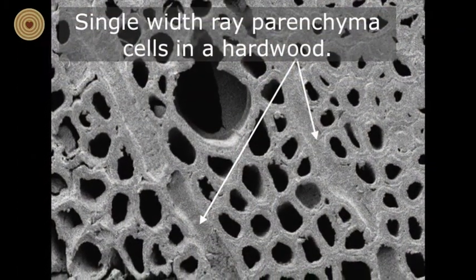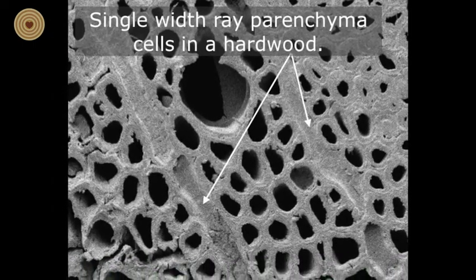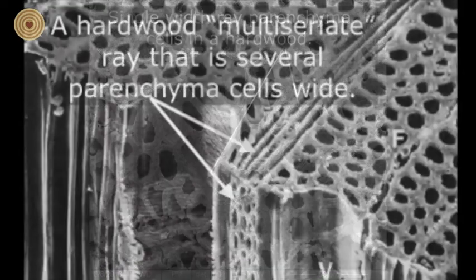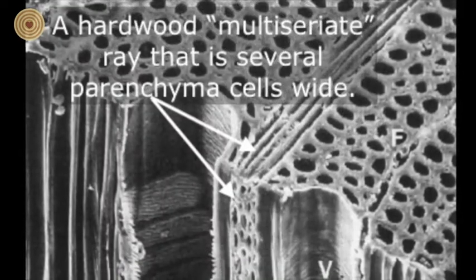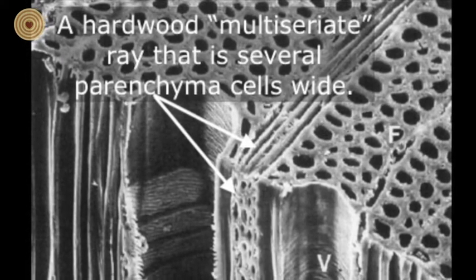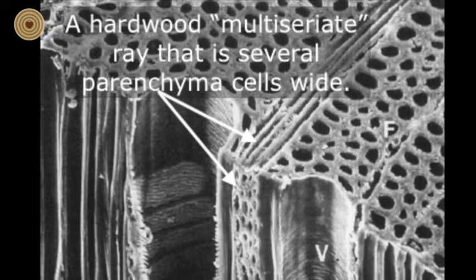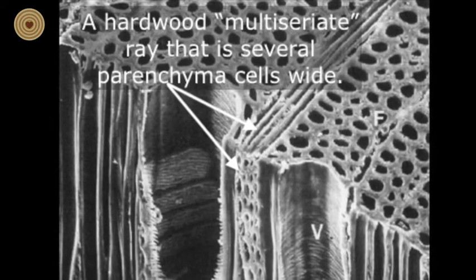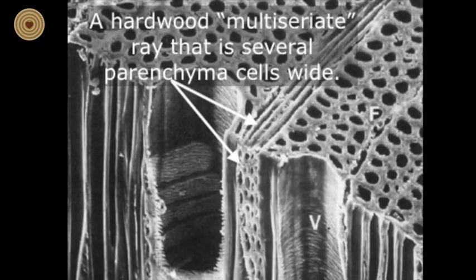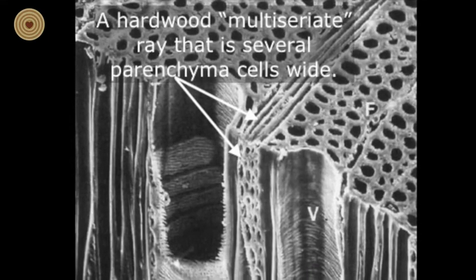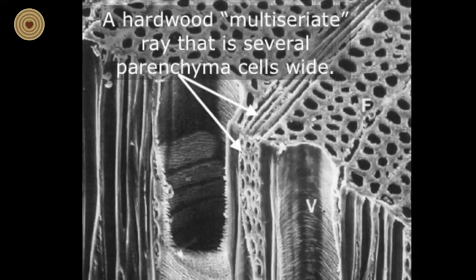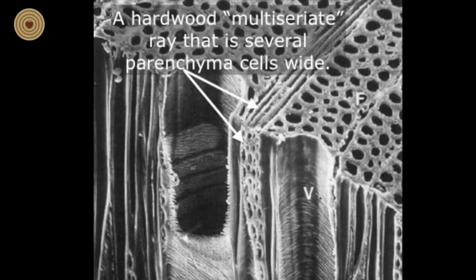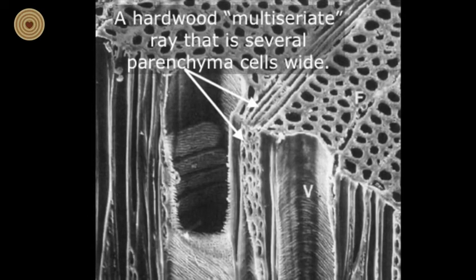Some rays in hardwoods may be only a single cell wide, but the rays in some hardwood species can also be quite wide. On a tangential surface such as this one, you can see hardwood rays that are many cells wide. These are called multiseriate rays, and they are found, for example, in species such as oak, beech, and ash. These large multiseriate rays provide some of the unique figure to wood at the macro level in furniture. If the wood is cut along these rays, the appearance of finished wood products can often be quite striking.